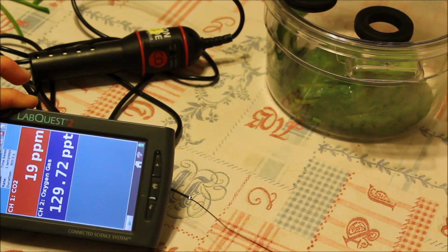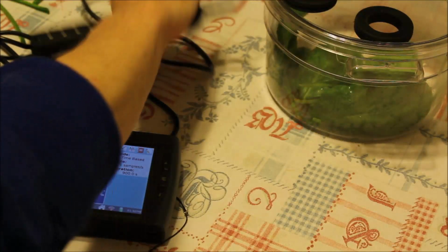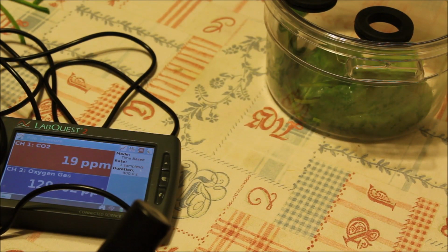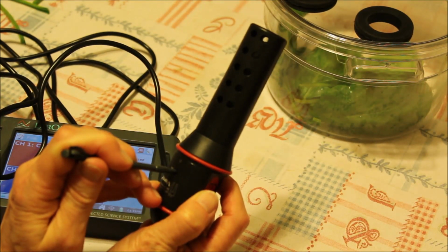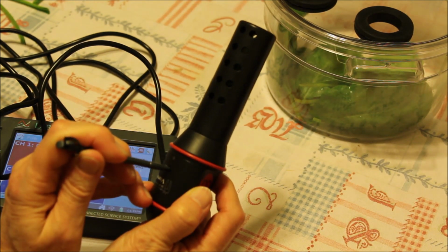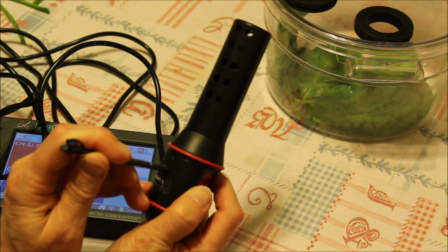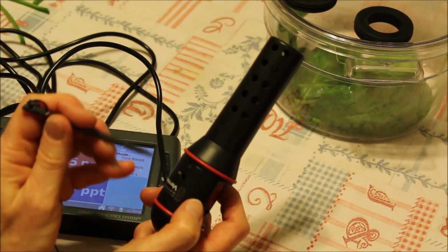So if the carbon dioxide is misbehaving, it should be around 300. So you will press the calibration button. You will wait a little bit, probably.